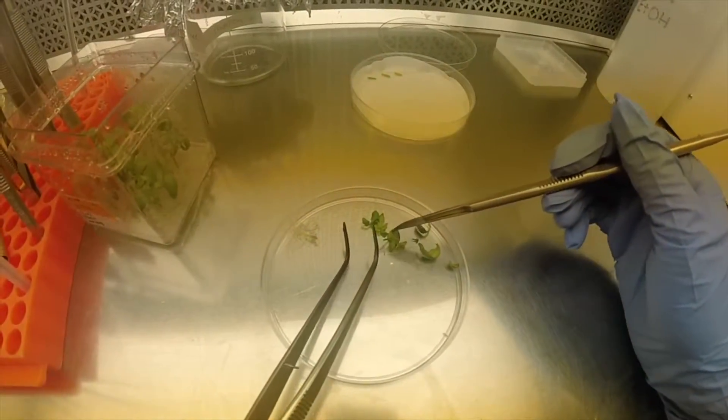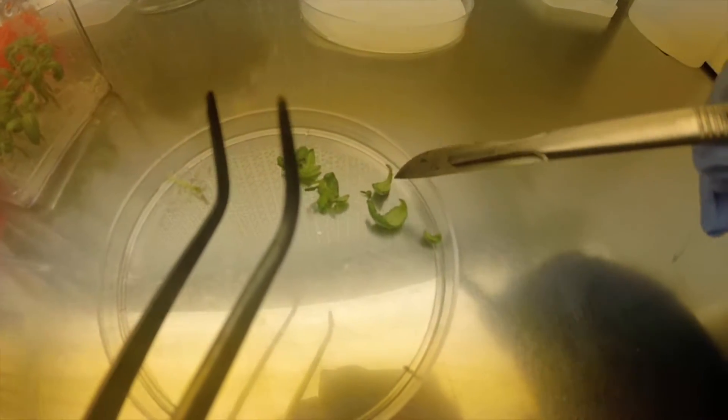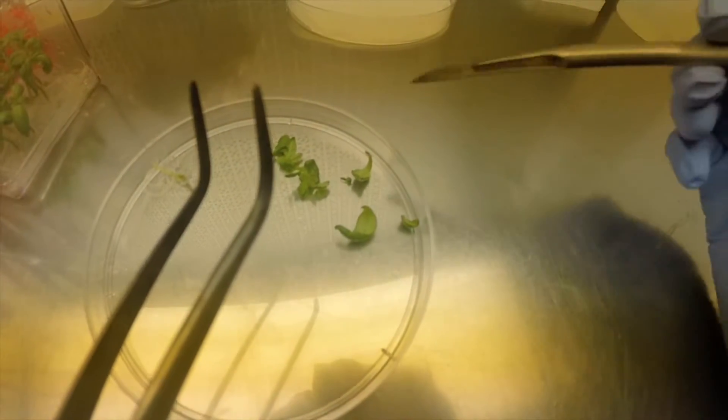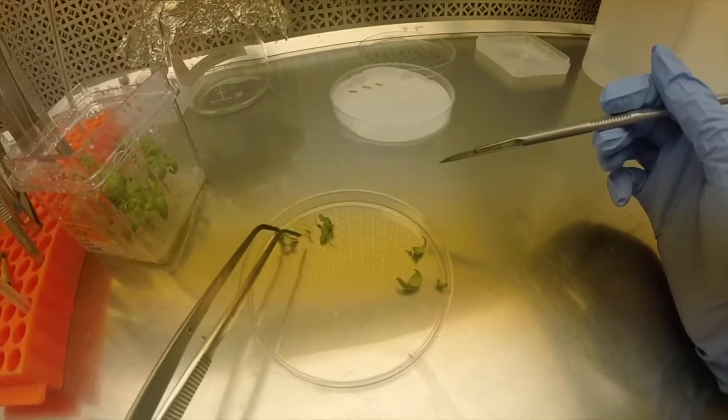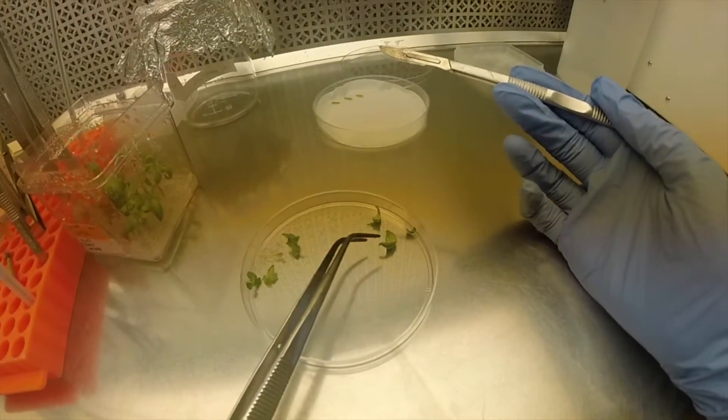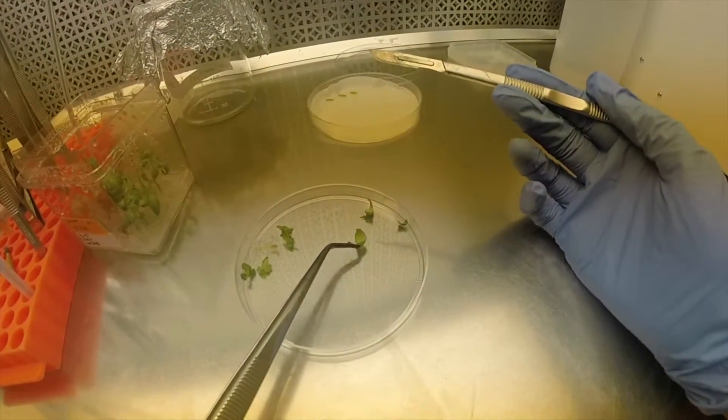These are the true leaves that are waste and these are the cotyledons. We'll set the true leaves aside. Most tomato plants have two cotyledons per plant.